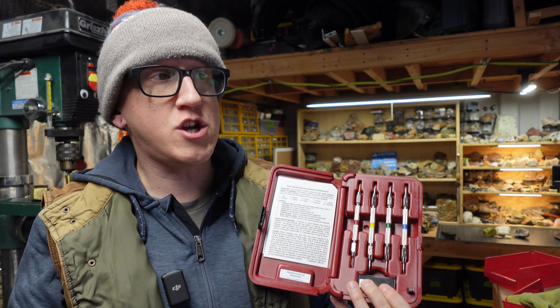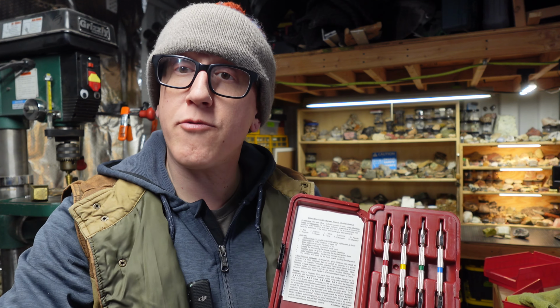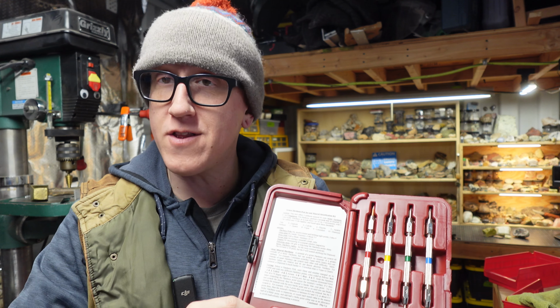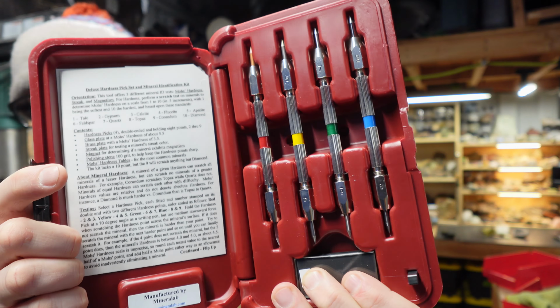I've only ever really shared this on an identification video where we went through all of the different testing that you can do on a rock or mineral to help you identify it. I will throw a link in here to that video, but on this one we are only talking about these guys today, these hardness pick sets.